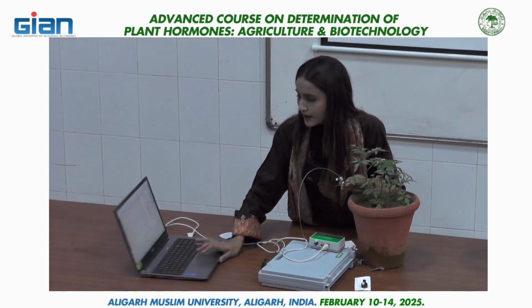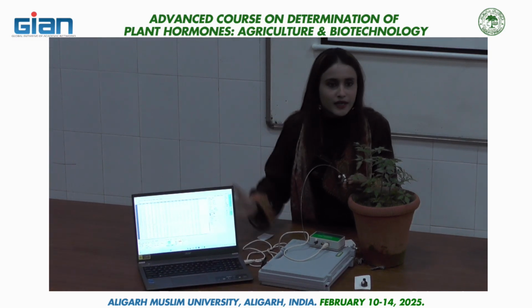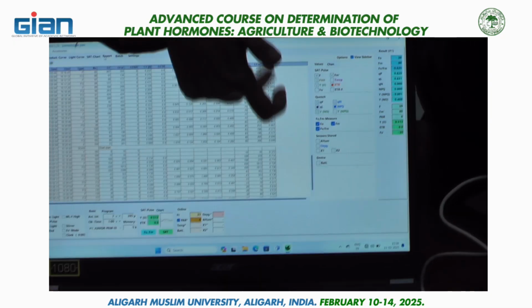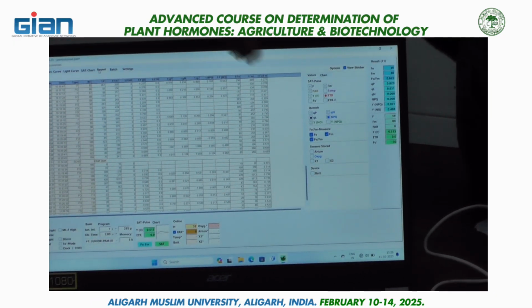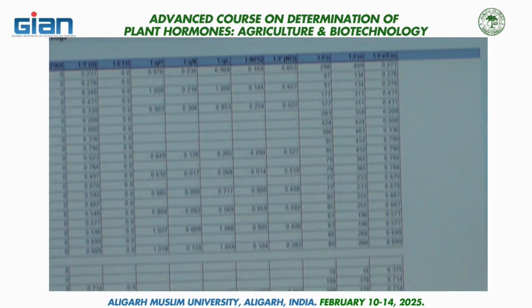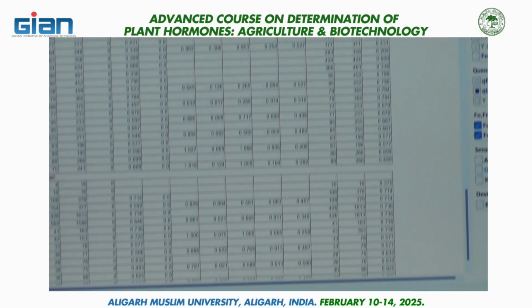In the report we are getting all these readings: Fv/Fm on this side, and then Fm, F0, NPQ. So we are getting different readings, and you can work on whichever you want.